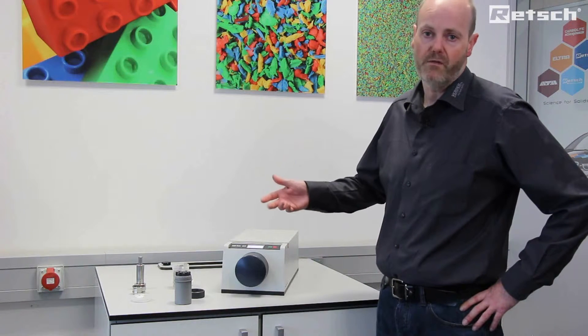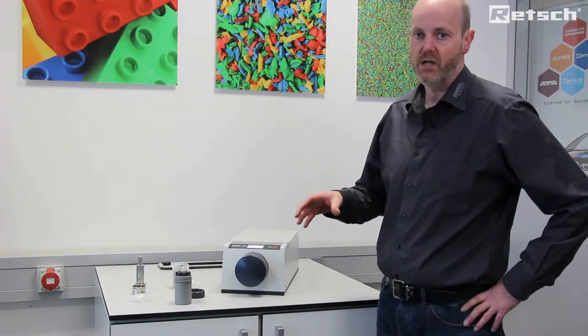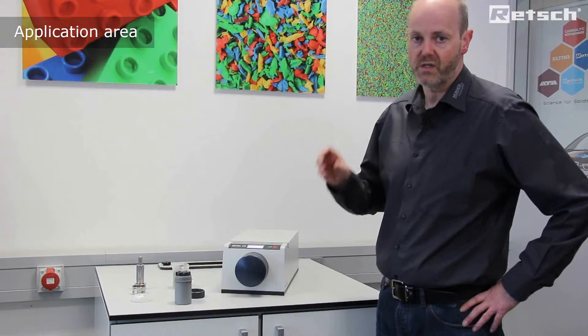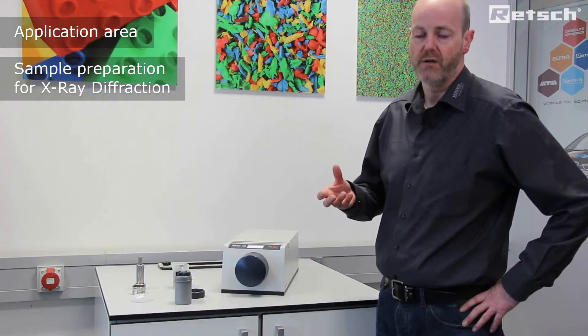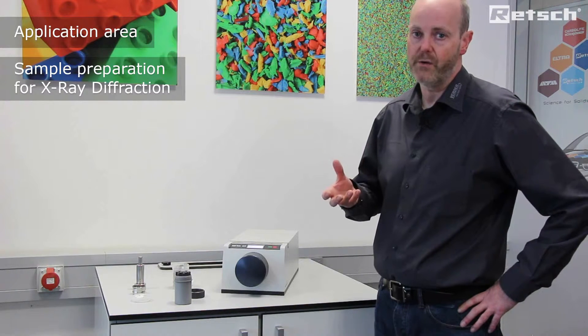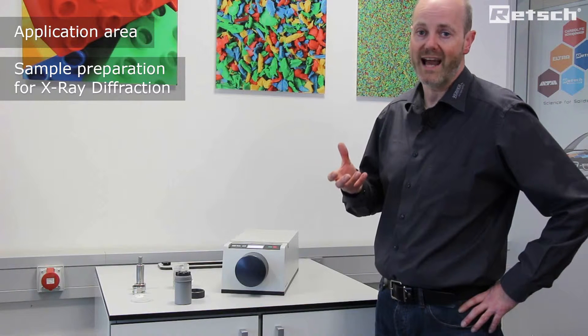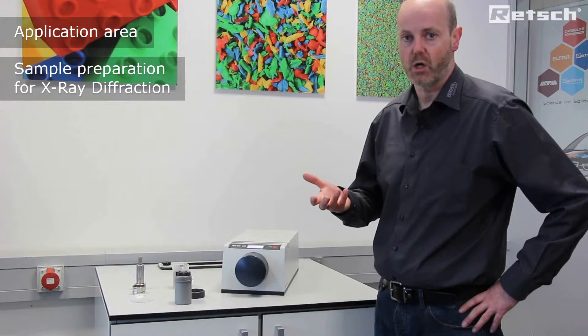Unlike many of the other ball mills, the application areas for this instrument are a lot more specific, in that this instrument is primarily used for the preparation of sample materials that are subsequently going to be analyzed by X-ray diffraction or XRD.